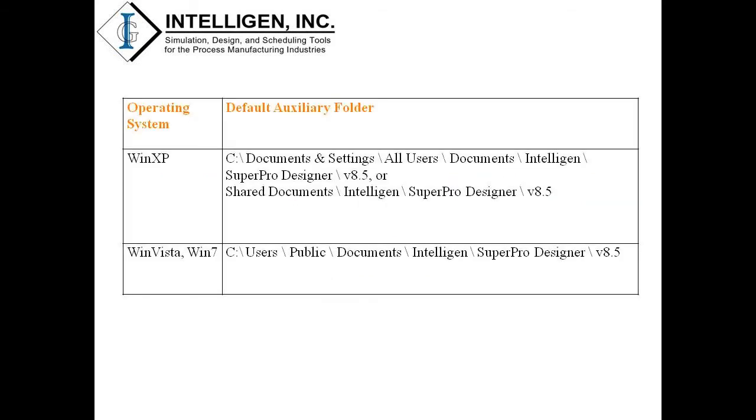The default location for the examples folder depends on the version of Windows which you are using, as shown on the table in this slide. The examples folder can be moved to another location on your computer that has read and write privileges in case you don't have full administration rights on your computer.